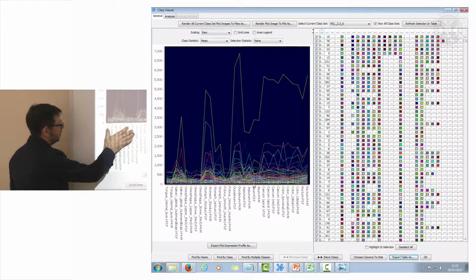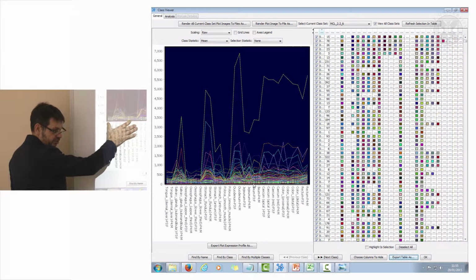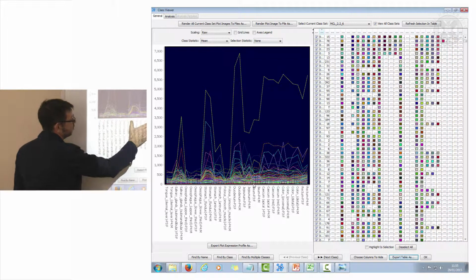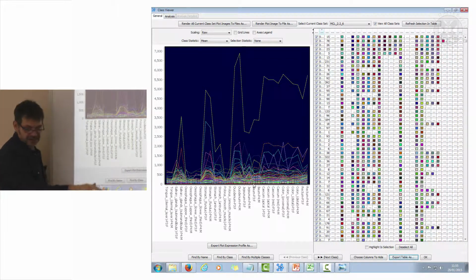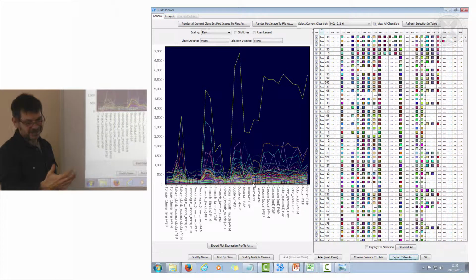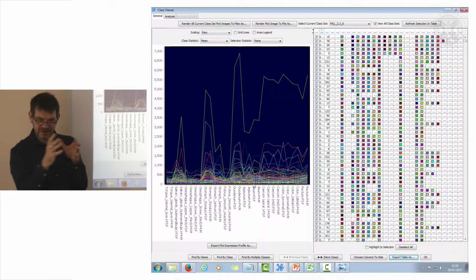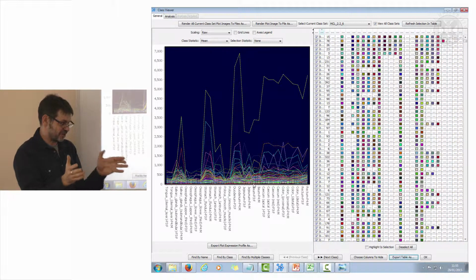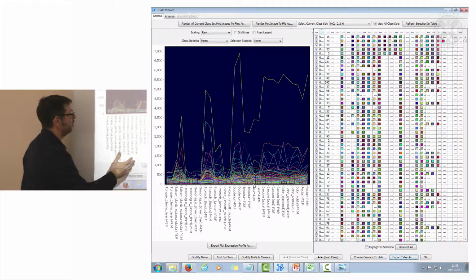Okay, so I would want to take each rat and show it as a separate group, 0, 2, 4, 7, 24, 0, 2, 4, 24, so that once you start looking at individual animals, they respond differently. And it's kind of useful to see that. When you start grouping everything together and say they're all the same, they're not all the same. And quite often what you want to do is see how variable they are.